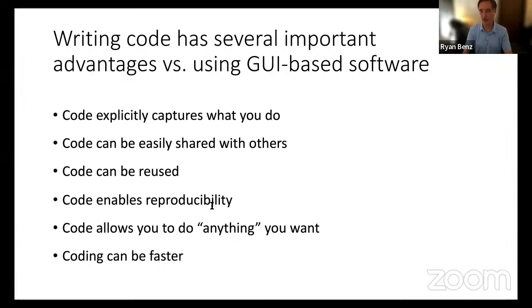They have software tools for analyzing mass spec data, which is great, and those can be really powerful, but you are essentially locked in to the methods and the analyses and the ways of doing things that they've decided to program into their program. And so let's say you wanted to change the way in which you normalize your data, or maybe you want to try a new statistical method that hasn't been implemented in any piece of software. You're not going to be able to do that through canned programs, but R gives you the flexibility to do that.